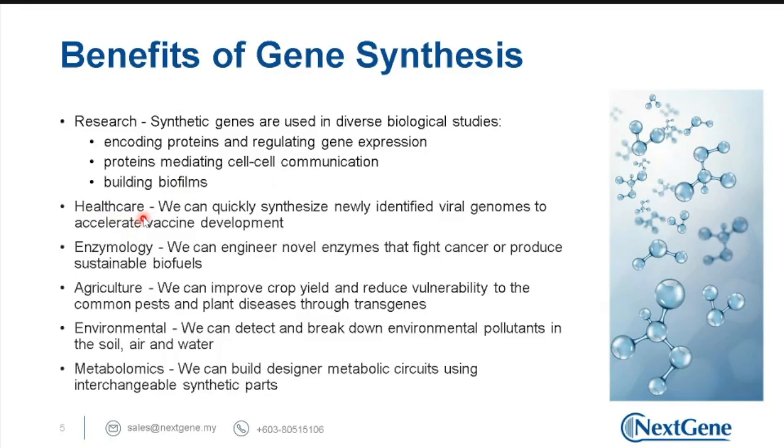In healthcare, in cases like the recent COVID pandemic, we can quickly synthesize a newly identified viral genome, and this will help to accelerate vaccine development. For enzymology, we can engineer novel enzymes that fight cancer, or for commercial use, for example, to produce sustainable biofuel.